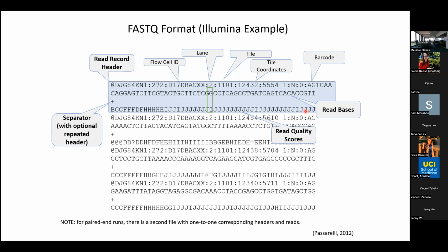You know, the barcodes are complicated, and it's because Illumina makes it that way. Reading the barcode on the I7, the P7 side, is really easy: after you've done your 100 cycles, that template is removed. Then they hybridize another primer and start through the index cycles.